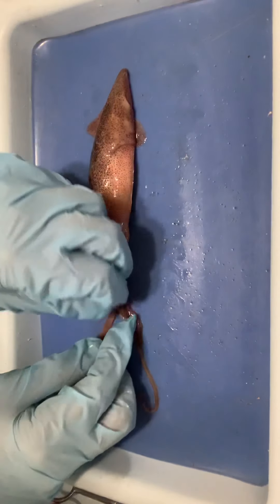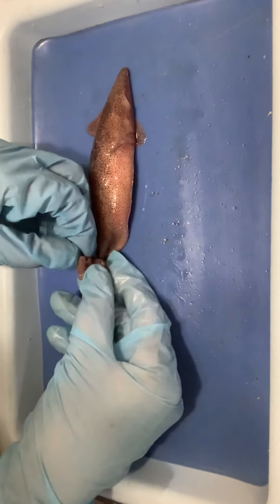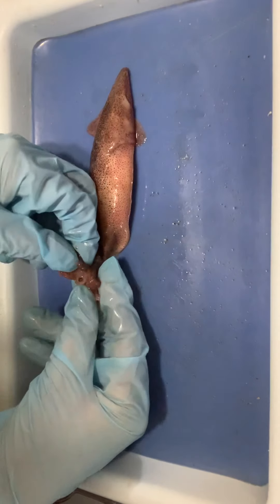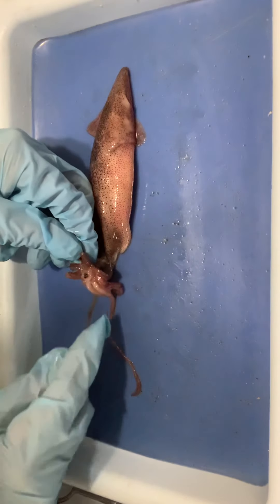If we open up between all of these appendages, we would find the beak — that little black dot you can see in there. If you had a chance to dissect, you would actually be able to feel it. The beak is right there in between all the arms and tentacles.